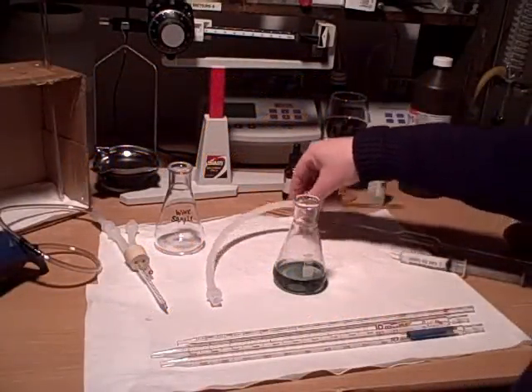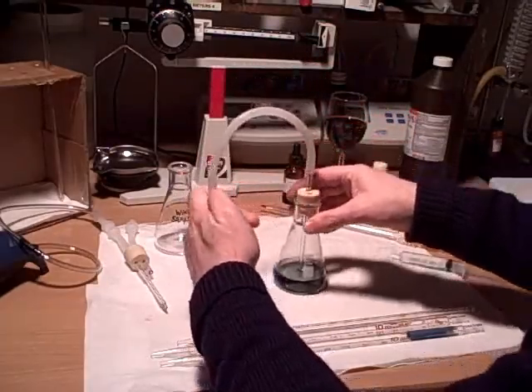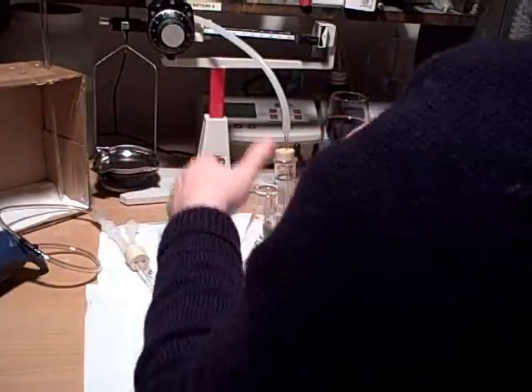Now that we've gone ahead and prepared our hydrogen peroxide, we'll go ahead and get that set up and set it aside. Now all that's left to do is go ahead and prepare the wine sample.